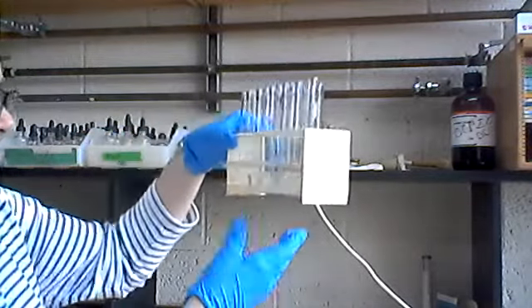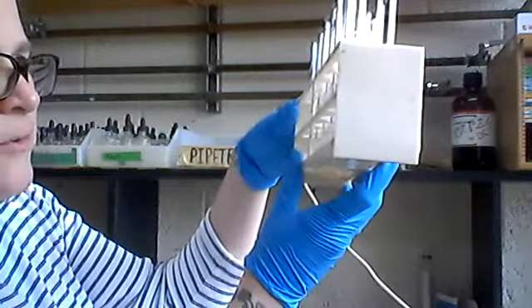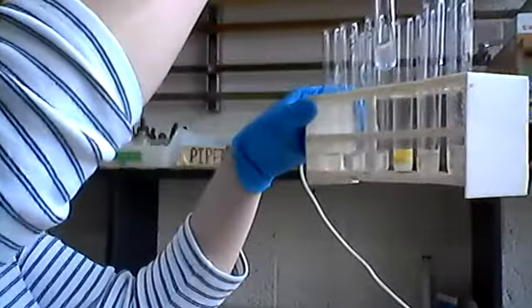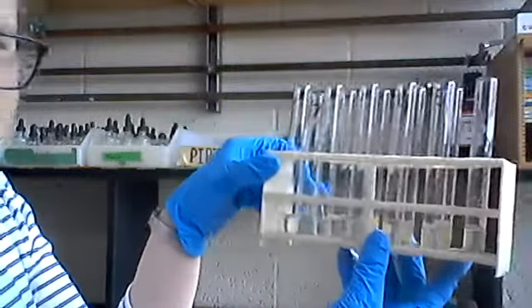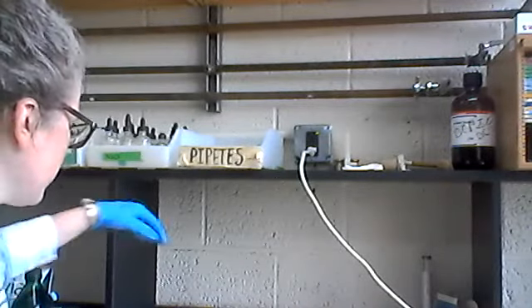And then I'm going to give it a few more minutes to take photos of the Biuret reagent. You can see on a few of them, it's a very faint color. You probably can't even see it unless I hold up something white behind it. But it's a very faint color, so I'm going to give it a few more minutes before I take the photos. But I'll get those photos taken and I'll post them all.